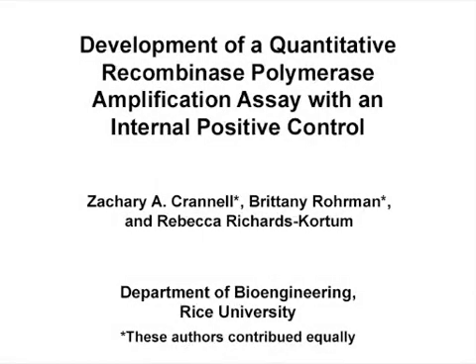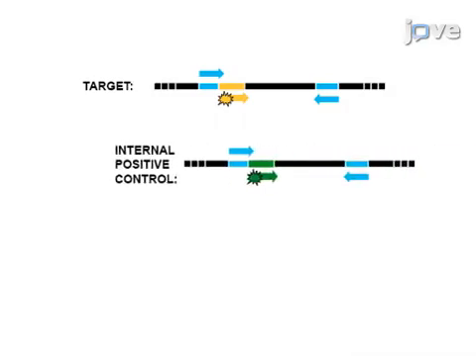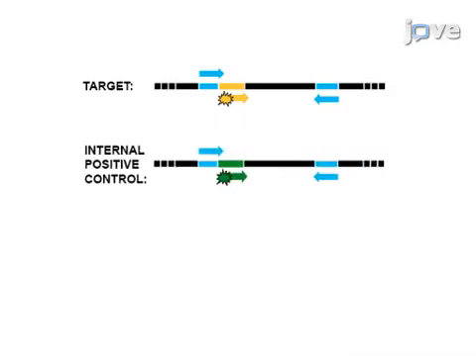The overall goal of the following experiment is to use quantitative recombinase polymerase amplification to quantify the DNA concentration of unknown samples. This is achieved by first adding the target DNA, internal positive control DNA, primers, and fluorescently labeled probes to the reaction.